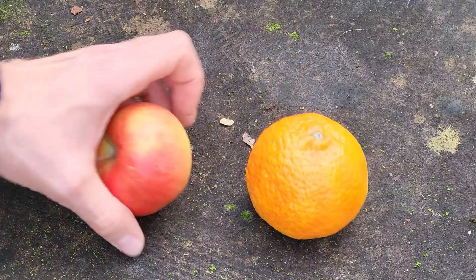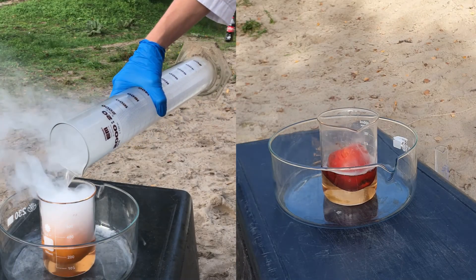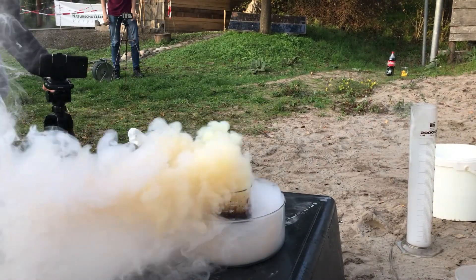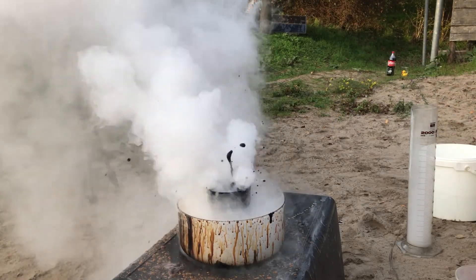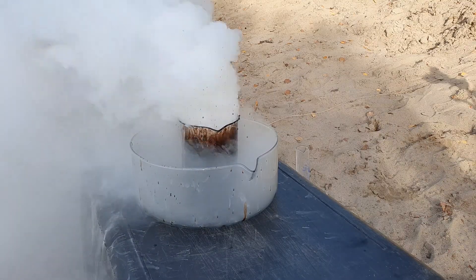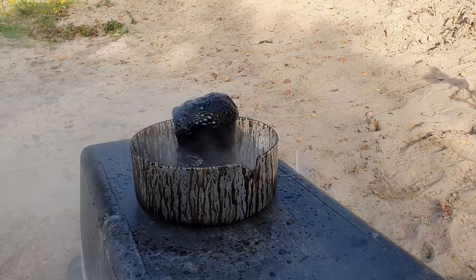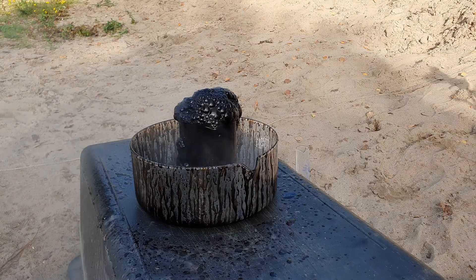We have all learned that you can't compare apples and oranges. However, before the great super acid, they are all equal — they basically turn completely into a black sludge if you have enough acid. This also creates a lot of highly corrosive acid vapor. The reason that the fruits get eaten so violently is that the acid reacts violently with the water contained in the fruit to form hot sulfuric and hydrochloric acid. Those hot acid molecules are capable of destroying pretty much any living tissue.